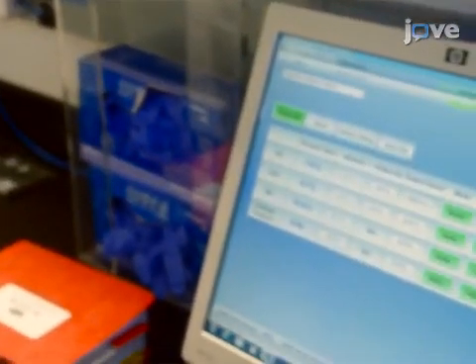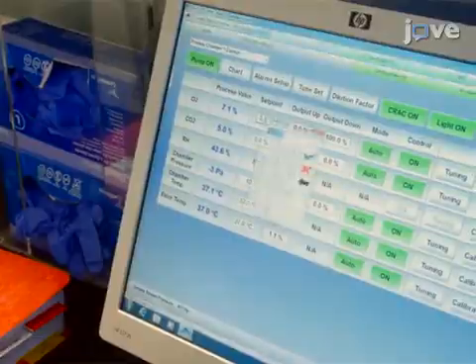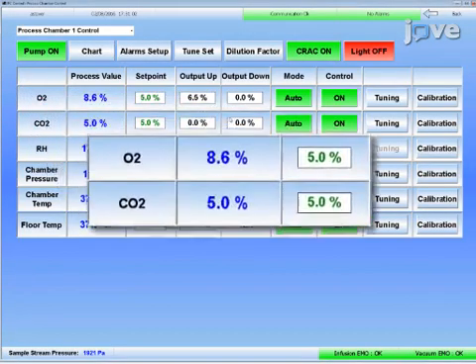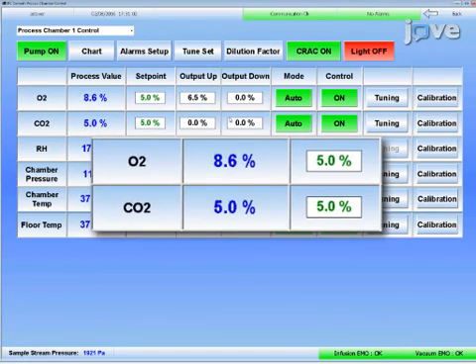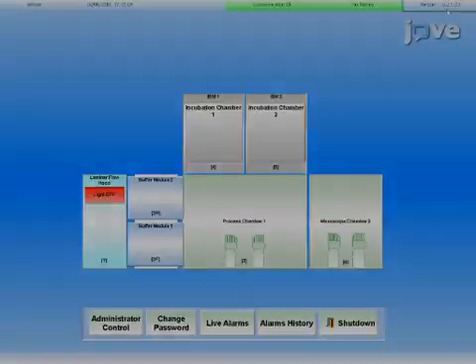Afterward, adjust the gas setpoints of all modules to the appropriate values. Match the carbon dioxide and oxygen levels of the chambers that will be exposed to one another. For example, adjust the process chamber to 5% oxygen before opening an incubator that grows cells at 5% oxygen. Also, adjust the buffer chamber that is used to add items to the process chamber.